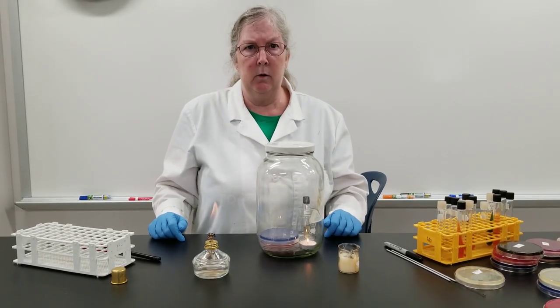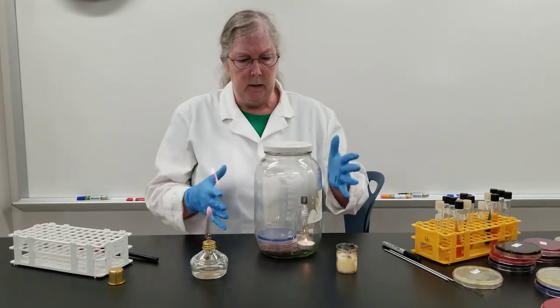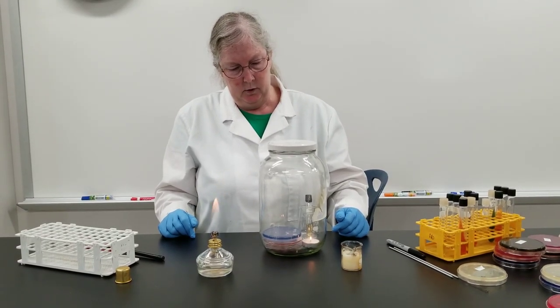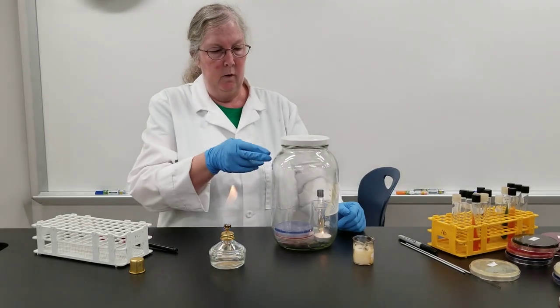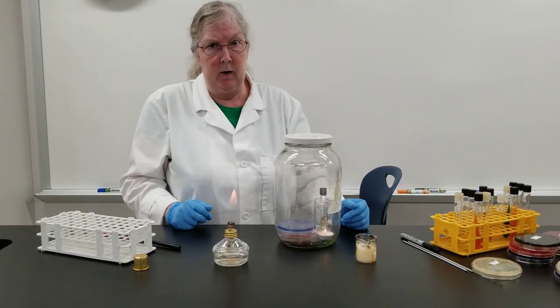We'll incubate them at 37 degrees C for 24 to 48 hours inside this jar. The candle will eventually go out when the oxygen is depleted. You could fill this jar all the way up to the top with plates — we have done that in the past when we've had a full class.